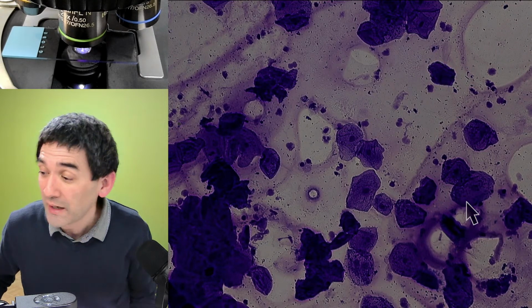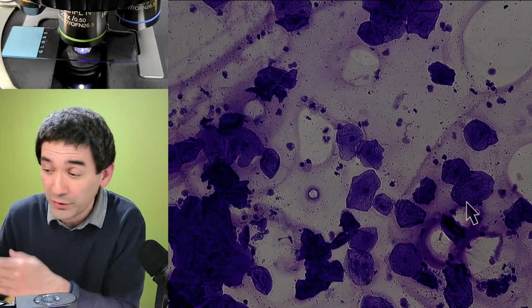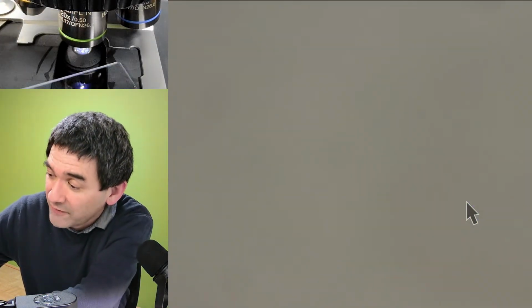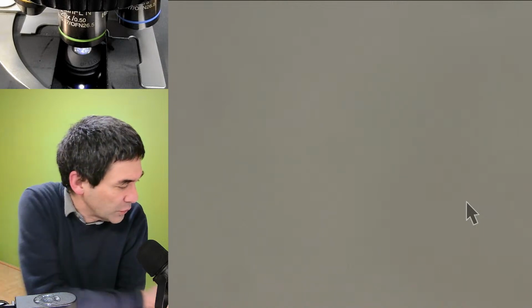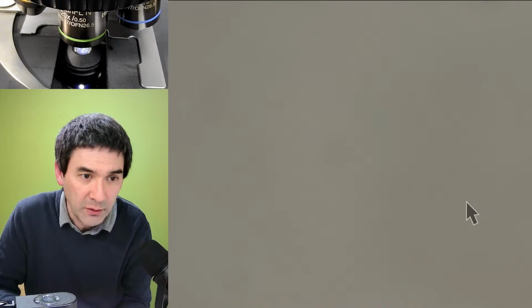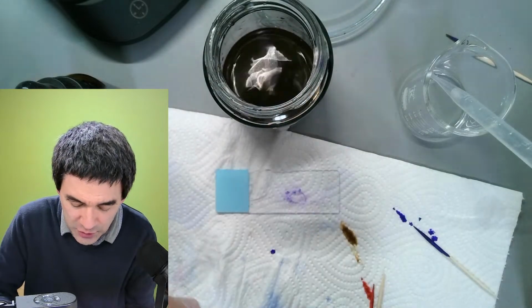What I want to do now is something I've not tried yet. I'm not going to interrupt myself now. I just want to complete the gram staining very quickly because I would like to know if it actually de-stains or not. So what I have to do next, according to the protocol, is add some iodine. So I'm going to do this very quickly now. Let's see how this actually works.